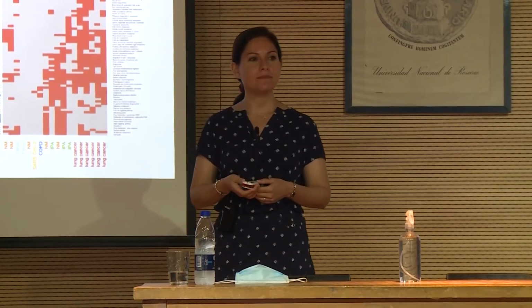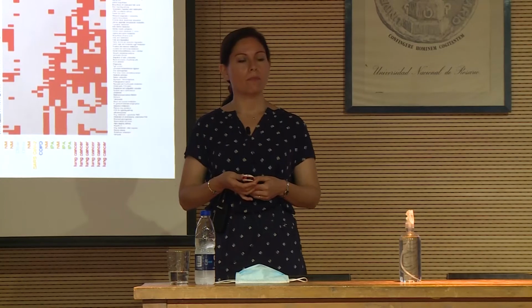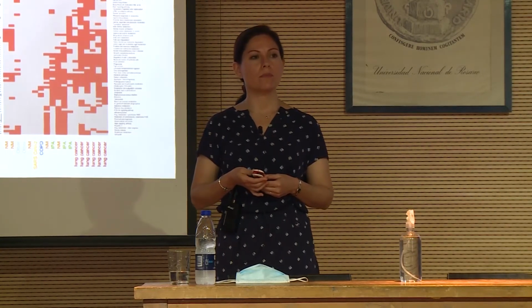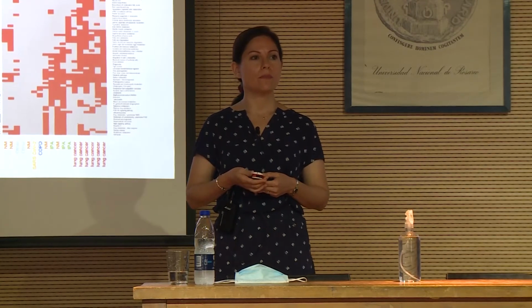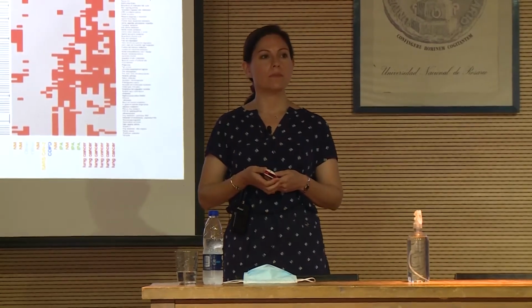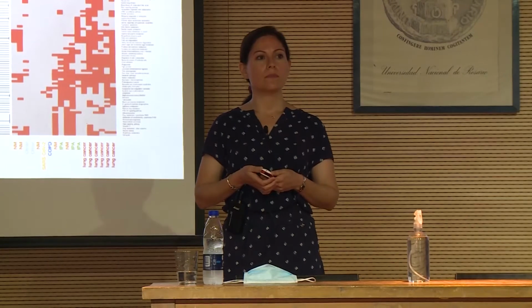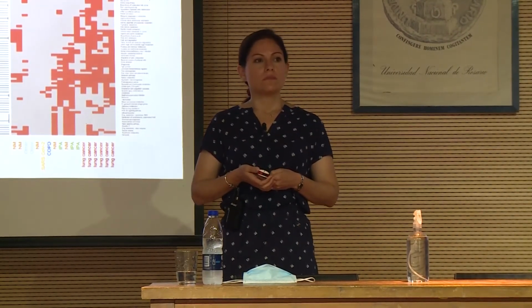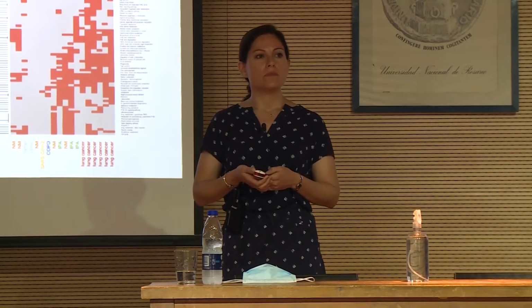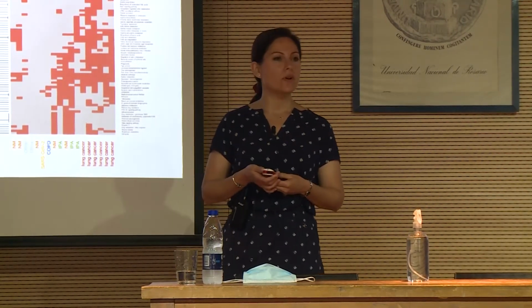A second question. I think it would also be very much in the interest of PRIDE, for example, that their data can be reused and that you link this to this nanomaterials database. So did you contact the people in PRIDE for this workflow, or did you just use their interface and that was it? No, we did not contact them.